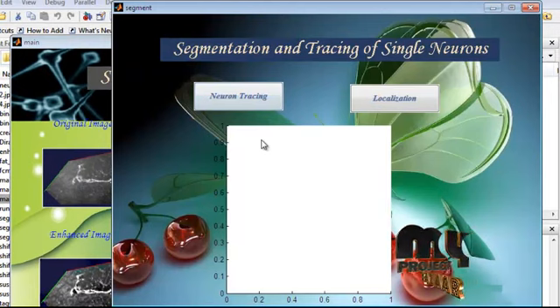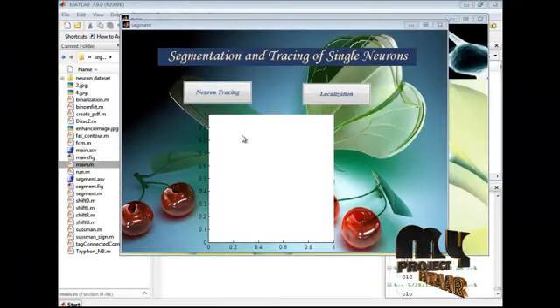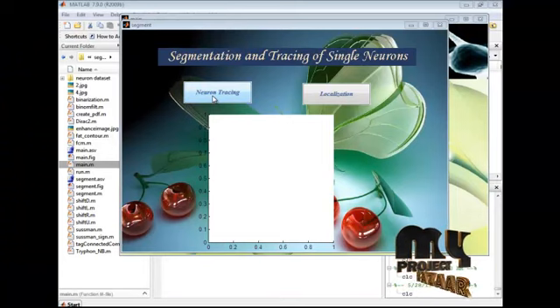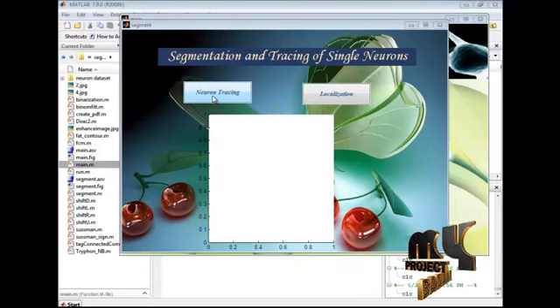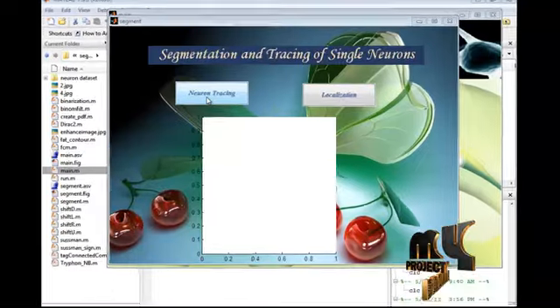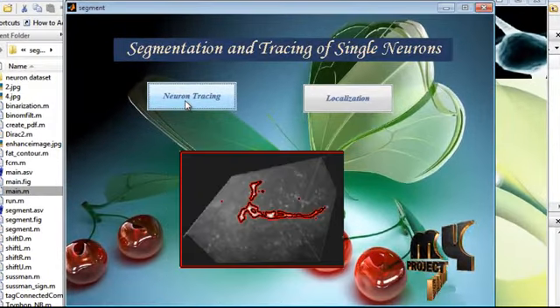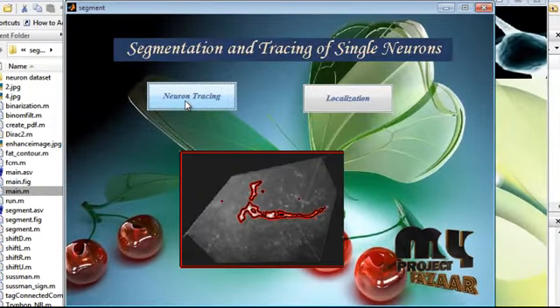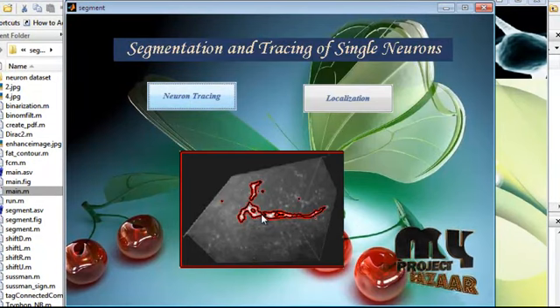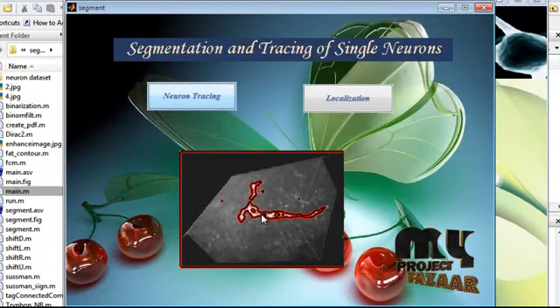In the tracing stage, we trace the neuron against the original image using the alpha-beta graph pruning algorithm. The neuron is traced here by the use of contour.